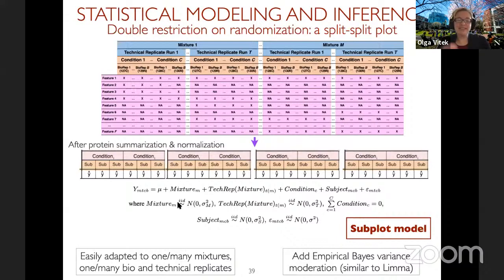It is a general model which says it doesn't matter how many conditions you have on the same mix, how many replicates you have on the same mix, how many runs you have. These models take all the data together because they're already normalized and comparable, and they decompose the contributions of mixtures, replicates, etc. And so they do exactly what you say. They're already accounting for blocking, but they're also putting all these differences together in a single signal to noise ratio and in a single p-value.